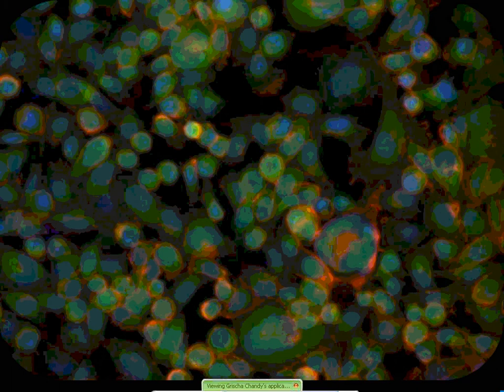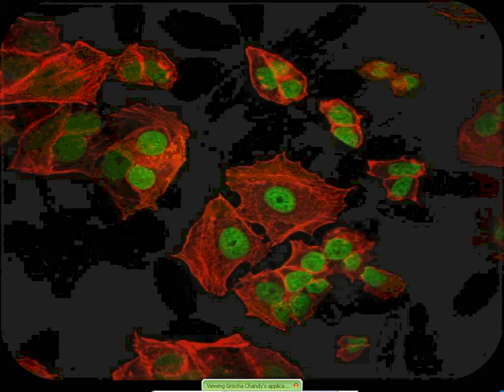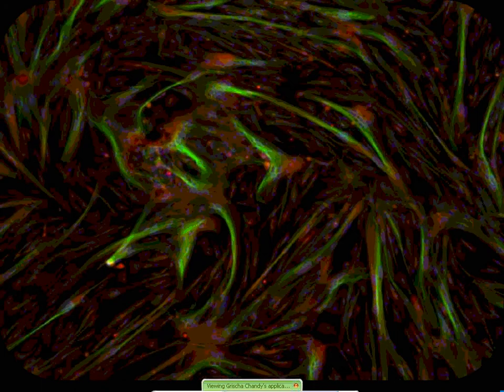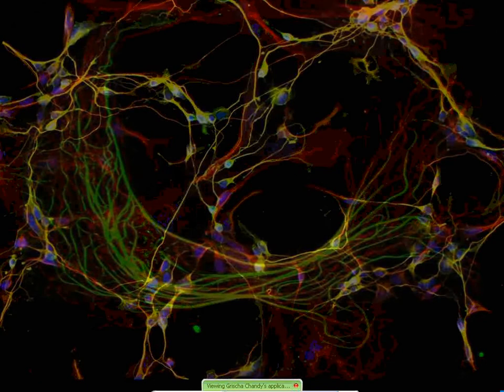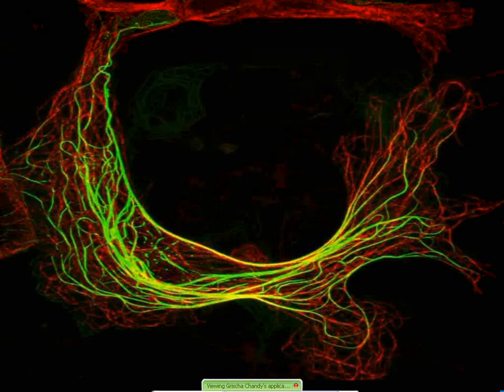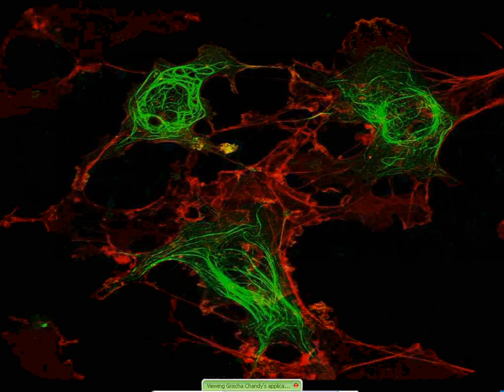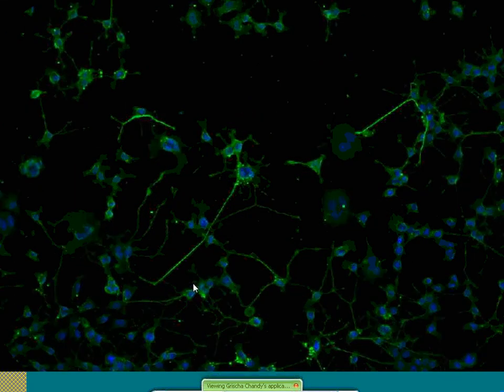We're currently involved in a collaborative project, for example, to make iPS cells and hepatocytes from a number of donors that have had idiosyncratic drug-induced liver injury. And the goal in that project is to essentially model the genotype of those individuals and to develop those hepatocytes into different assays and to evaluate different endpoints to look for the phenotype.